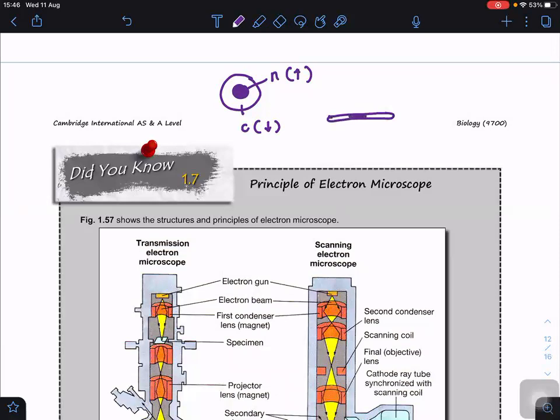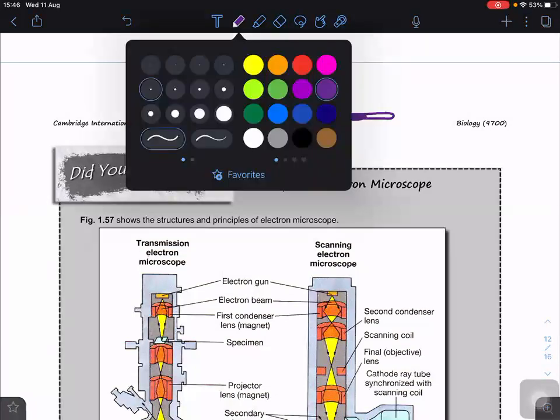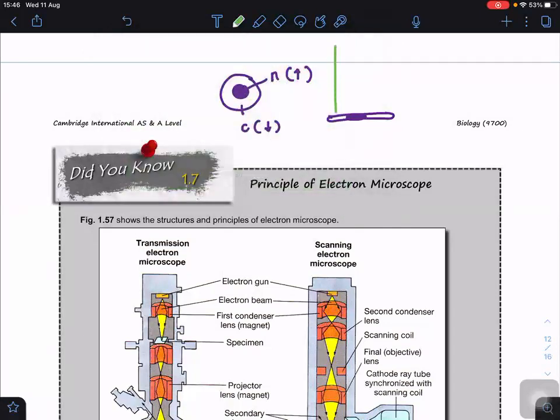this is the nucleus. When electrons are bombarded, the electrons pass through, transmit. Can you see that more electrons will be able to pass through the cytoplasm? But fewer electrons pass through the nucleus, because it is blocked by the heavily stained nucleus, since the nucleus takes up more heavy metal.